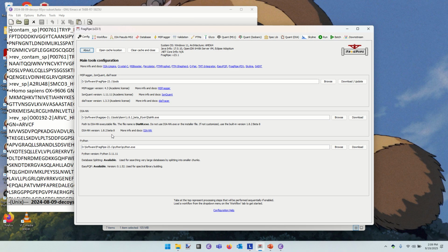If you were to download DIA-NN from their website, you would end up getting version 2.0 something at this point. So the version shipped with FragPipe, I think, is quite specialized to answer these particular calls that get made to the software. It's not necessarily something where you can just sub in version 2 and everything would work fine. All right, and Python is installed. That's all in a good place.